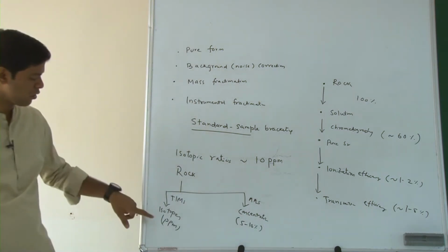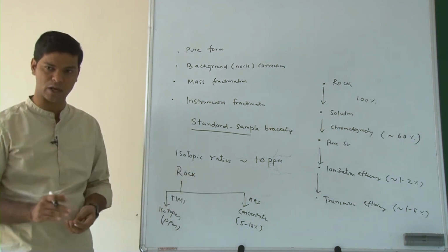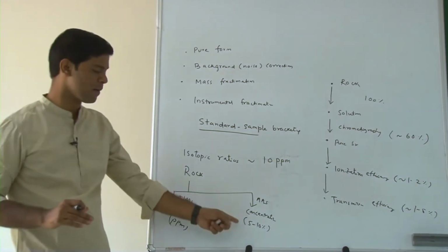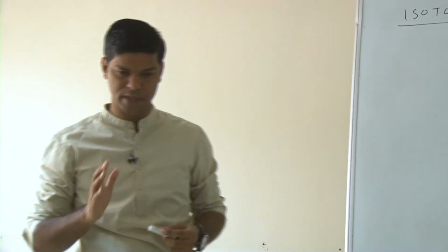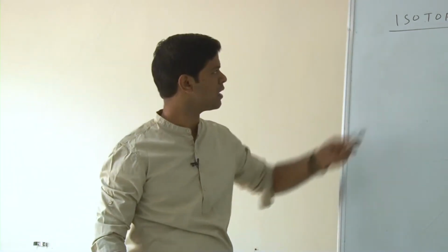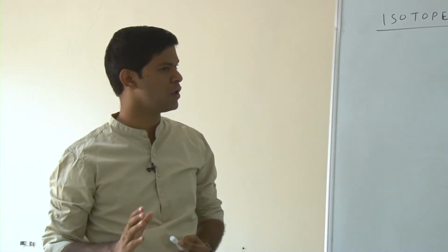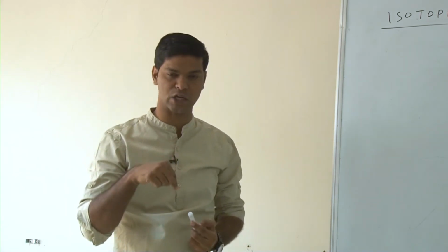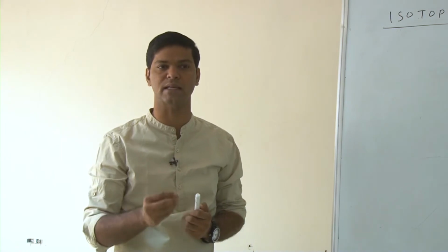Okay. But when you are doing a ppm kind of analysis, you want to have the concentration in the same aliquot, particularly in case of geochronology, and you want to have a better precision, at least of the order of 1%. So, for precise isotopic and concentration measurement, you can rely on an approach which is called isotope dilution. So, what do you do? You do not measure the sample as it is, but add a tracer into it, prepare a mixture and do the isotopic analysis on the mixture.